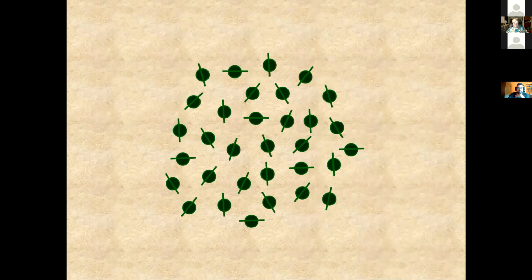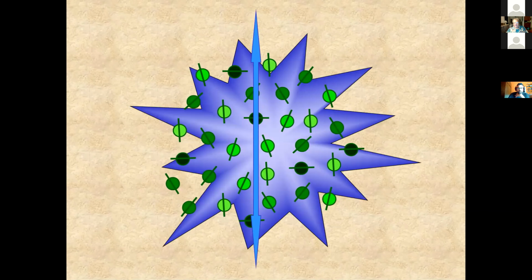Let's illustrate this with this little cartoon. Here we have a bunch of molecules in the ground state, and that's the direction at that instant of time of their absorption dipole, transition dipole on the molecule. Now we excite with vertically polarized light, and the bright circles correspond to the molecules whose dipoles are more or less aligned.